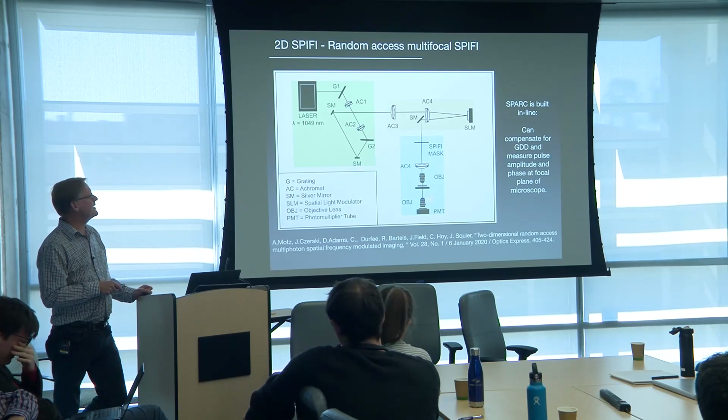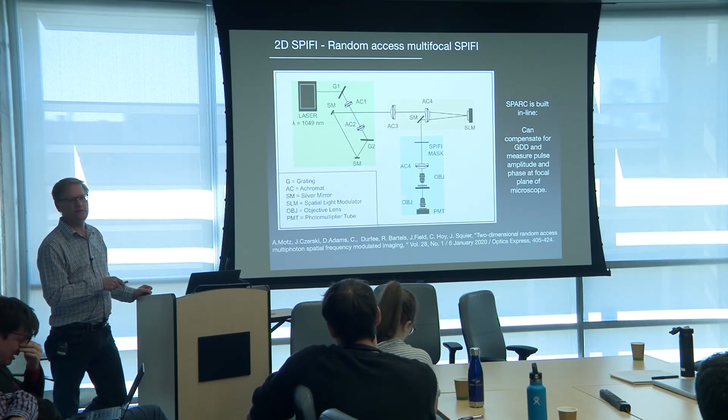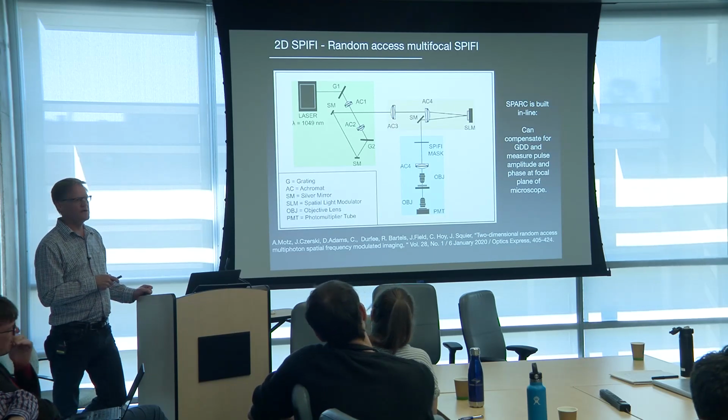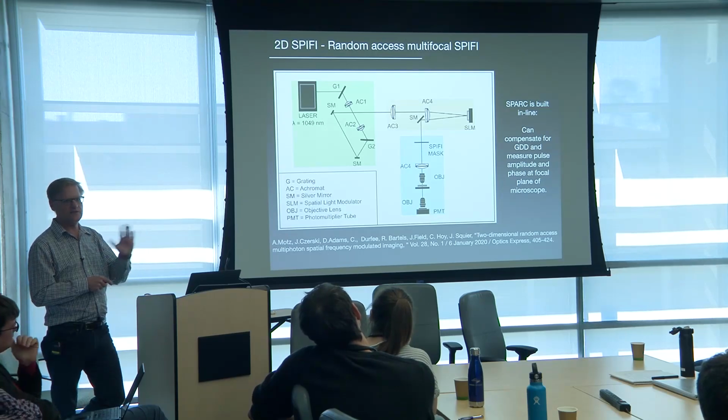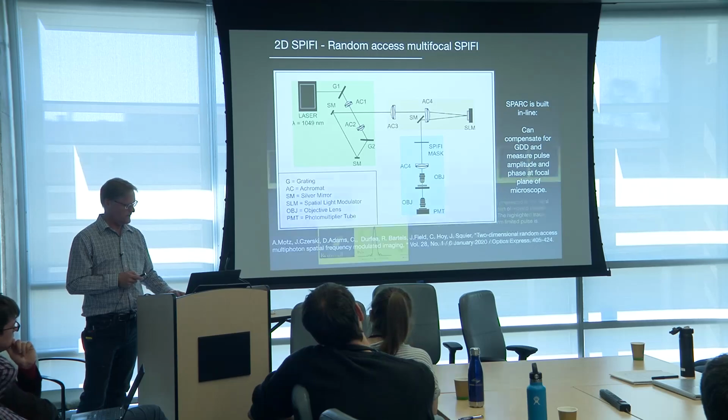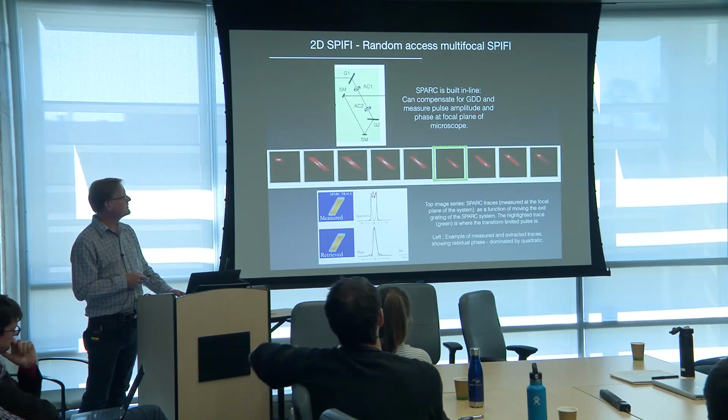And then you scan it and make a measurement. Yeah. And what we'll say is we can actually turn on the modulator, create multiple foci, and we can actually do all the individual foci across the field of view. So yeah, a lot going on in all of this stuff.